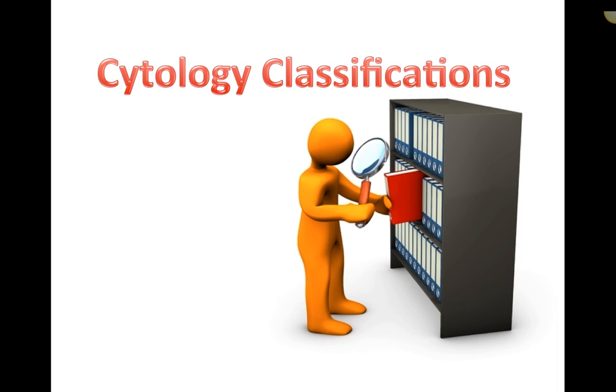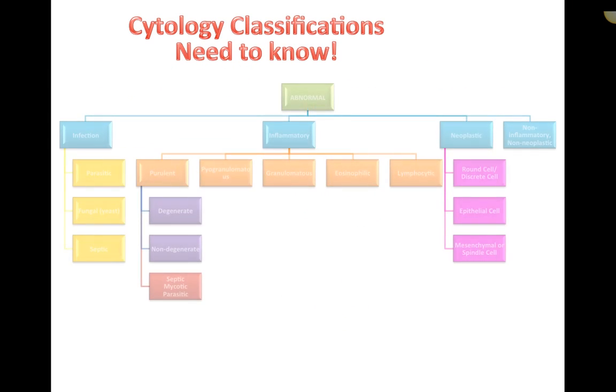Are you seeing cancer cells? Are you seeing inflammatory cells? Are you seeing infection? And be able to report those findings back to the veterinarian for appropriate treatment. So it's really important, hence it's quite in detail and in depth.